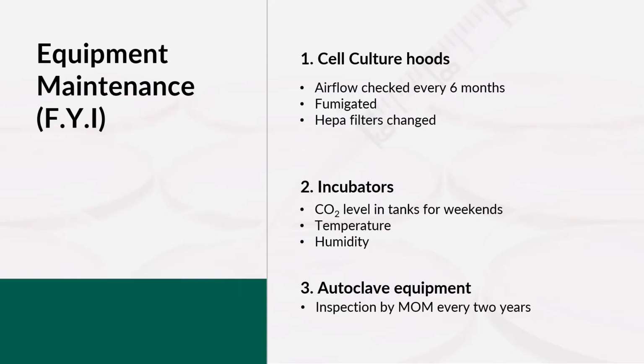HEPA filters are basically designed to trap very small particles, dust, pollen, microbes, everything in the air. So regularly changing these filters will ensure that they remain effective at capturing all these contaminants, hence maintaining the air quality in the cell culture hood. Of course, this maintenance of the cell culture hood is really critical because you know what the purpose of cell culture hoods is, right?